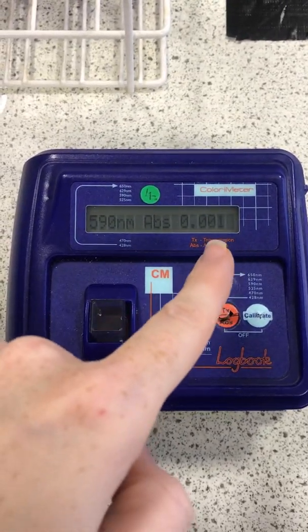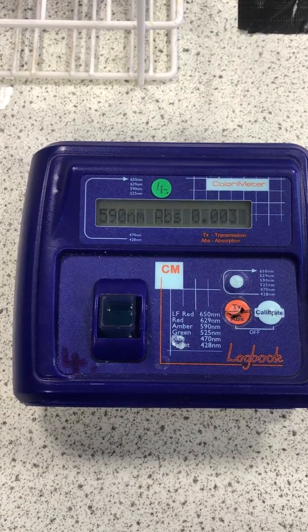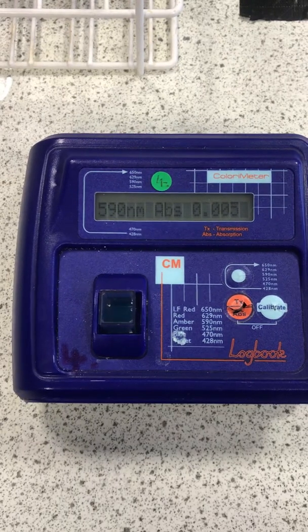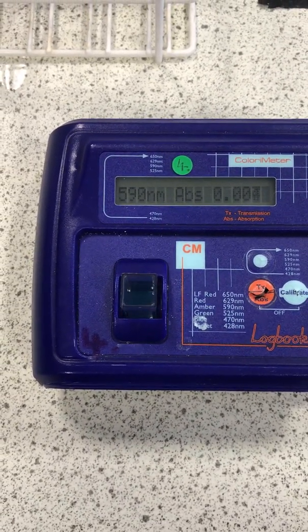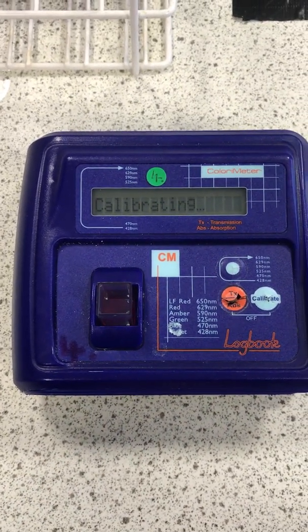You'll see the colorimeter can sometimes move around a little bit. But when it does, you should usually spend some time just looking at the most common number or the average sort of number. Here it's jumping around a bit. I might ask it just to calibrate that again.